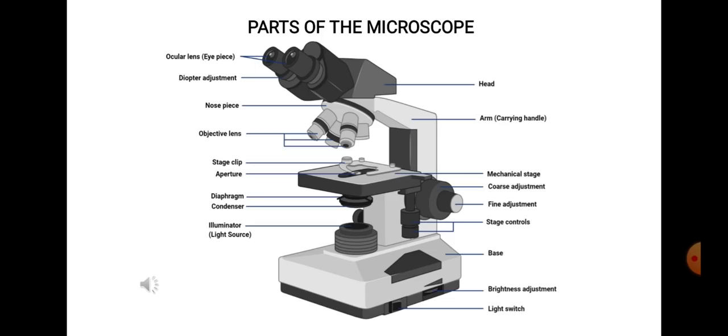This is an image of a brightfield compound microscope, and it is important to know the functions of each part. We will only be discussing some of its parts, therefore, it will be your task and your responsibility to research the various parts that will not be discussed in our pre-lab discussion.